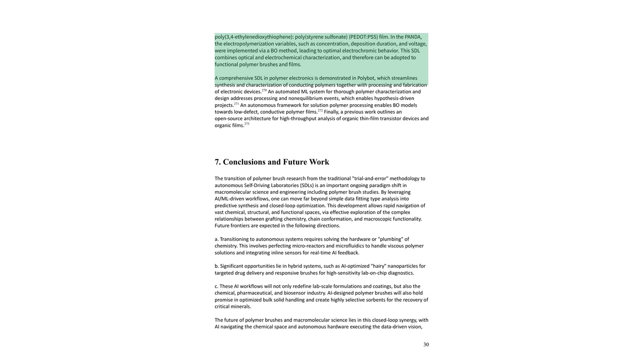The paper mentions several examples of such systems already in development, like Panda, a low-cost SDL for studying conducting polymers, and Polybot, a more comprehensive system for polymer electronics. So where does this leave us, and what is the future for the field of polymer brushes? The paper concludes by framing this as an ongoing paradigm shift, allowing researchers to rapidly navigate the vast chemical and structural parameter space to discover new materials with tailored functionalities.